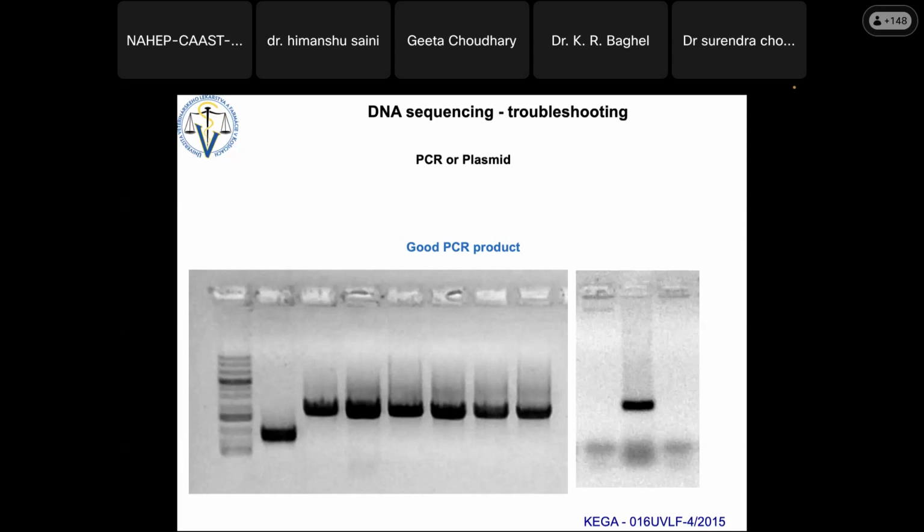Because actually now ethidium bromide is banned for DNA purposes. We cannot use ethidium bromide. I think you are using hand gloves and everything, but it is extremely carcinogenic, and you should not use ethidium bromide. You should use SYBR Gold. It's extremely cheap.